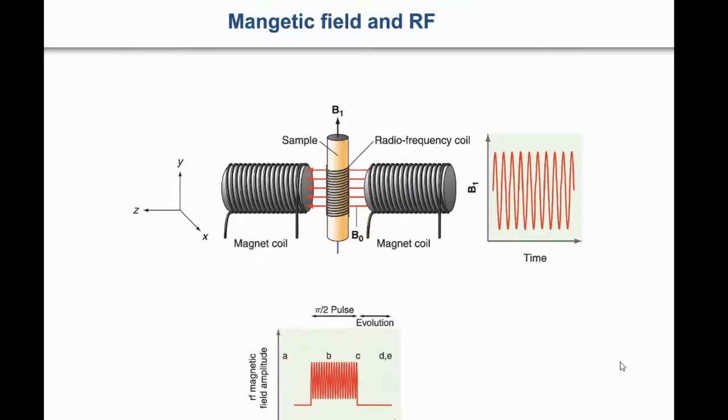And that supply, we pass it through a gating mechanism where at any point of time, it will be zero. And then suddenly you increase it, so it will go up like that. And then you close the gate. And then it remains like that. So this is a pulse, a short burst of radiation. Okay. Now what it does is that it will not be exactly 400 megahertz. It will be just 400 megahertz plus a few kilohertz.